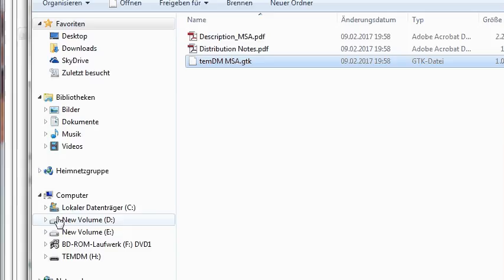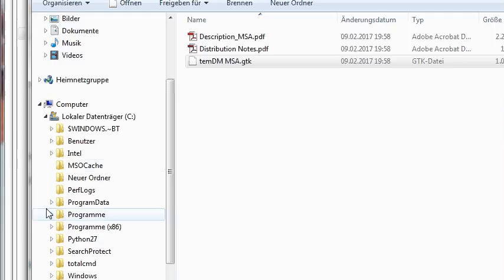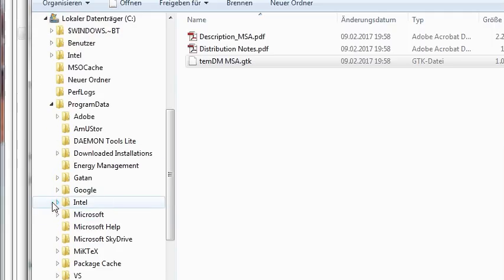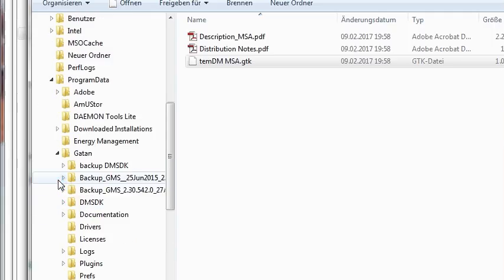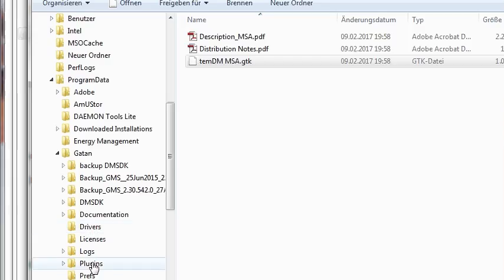And then localize the folder where Digital Micrograph keeps its plug-ins. It's typically in C drive, Program Data, Gatan, Plug-ins.